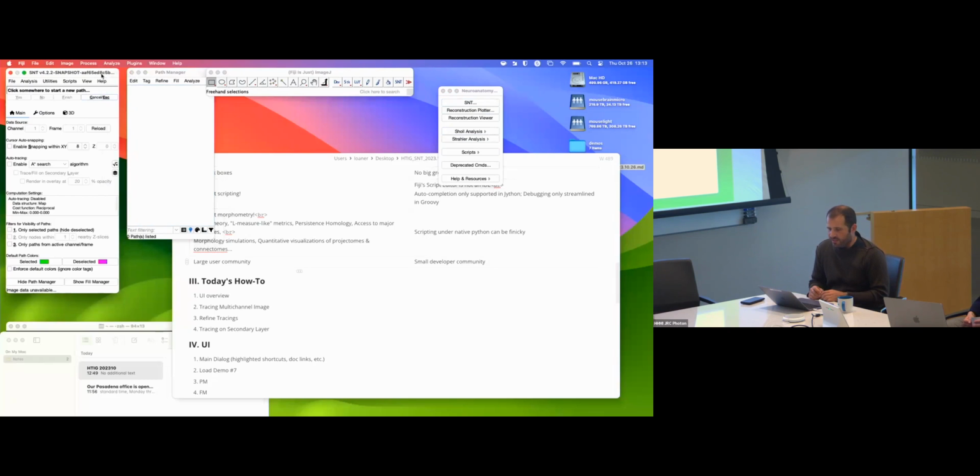It's not fancy at all, very simple. And it was very funny. One of the concerns one of the reviewers had was: this is nice, I can understand this is powerful, but it's Fiji, and Fiji is super clunky, it's ugly, I don't understand, it's super crappy, it's hard to use. And so literally we spent most of the review trying to prettify things.